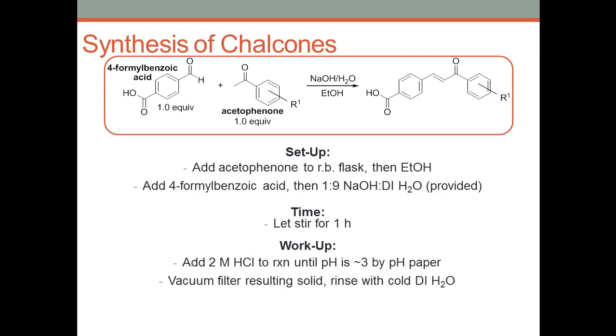This will cause the product to precipitate out, so then you just isolate it via vacuum filtration, and you're going to rinse the product with cold water. Don't forget to take your NMR, and with this one you're going to need to do that with deuterated DMSO as opposed to chloroform.